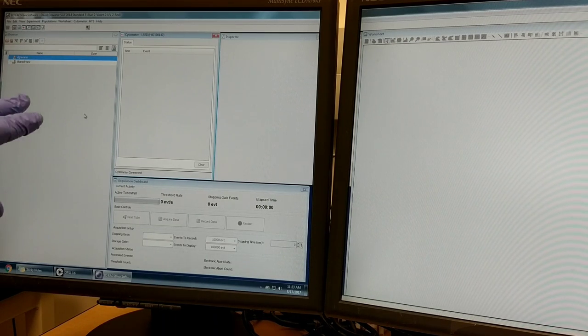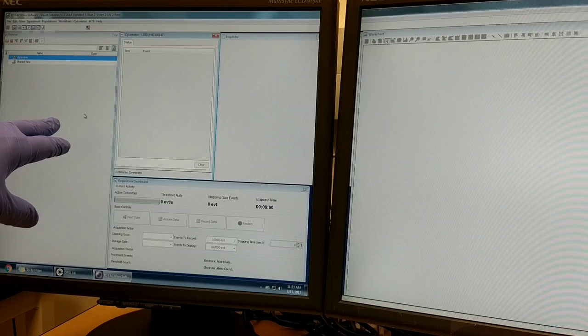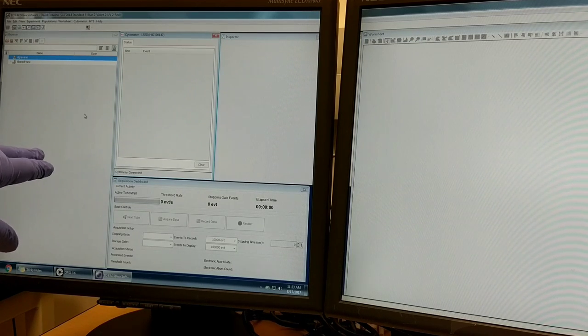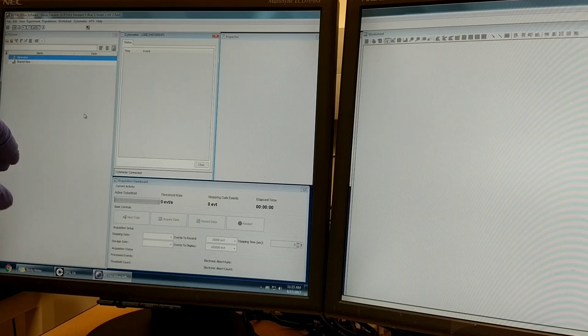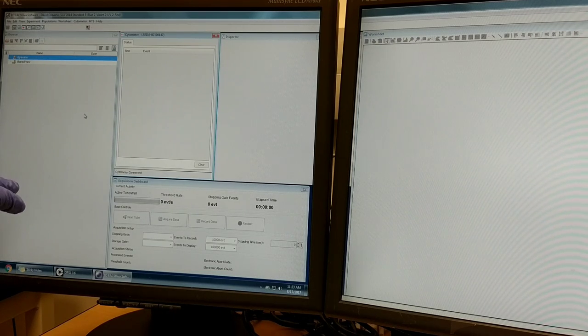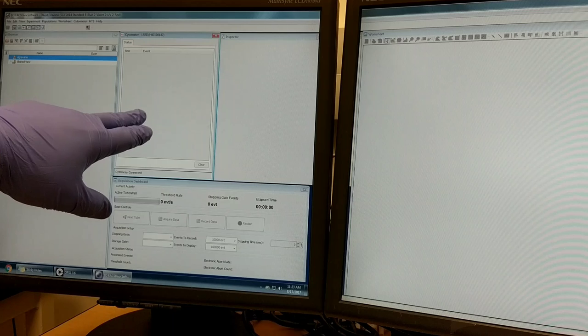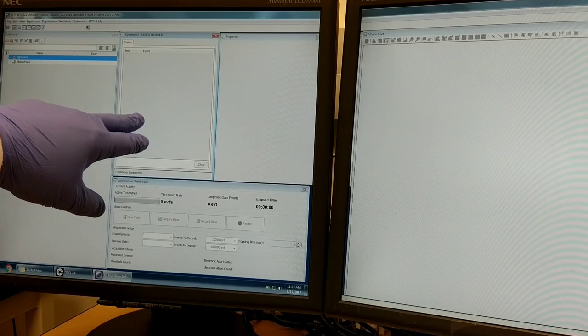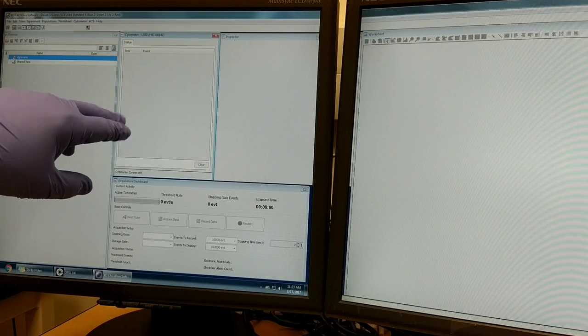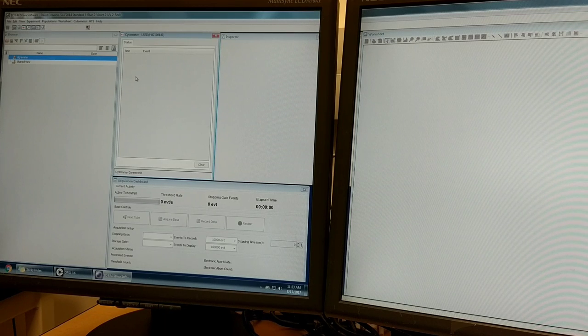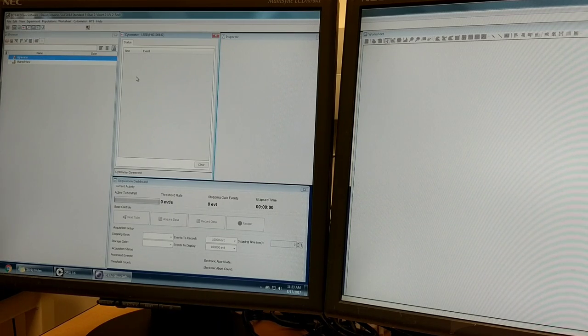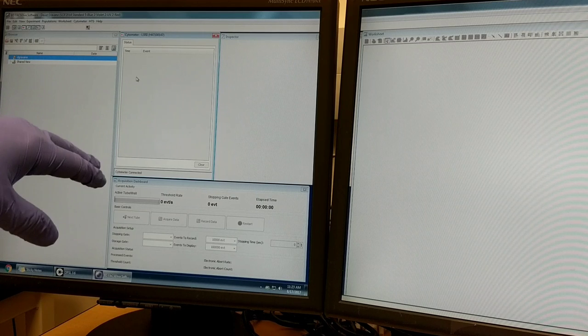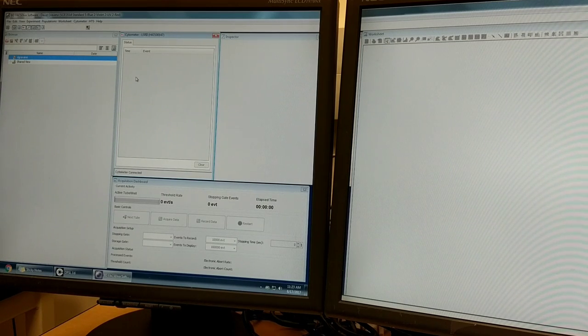The first window on the left is called the browser. This is basically a file browser, like Windows Explorer, to navigate your files and experiments. The cytometer window has important settings including which parameters are active, their voltages, compensation values, and threshold settings.